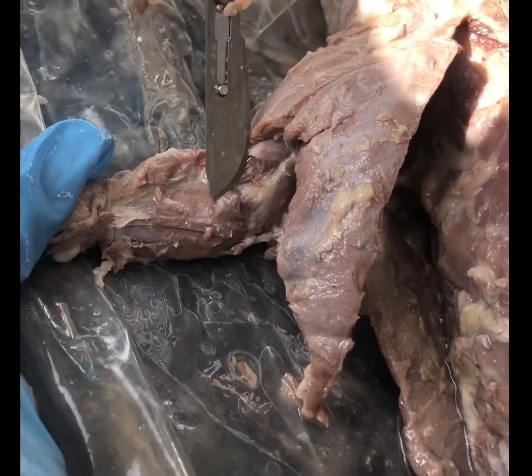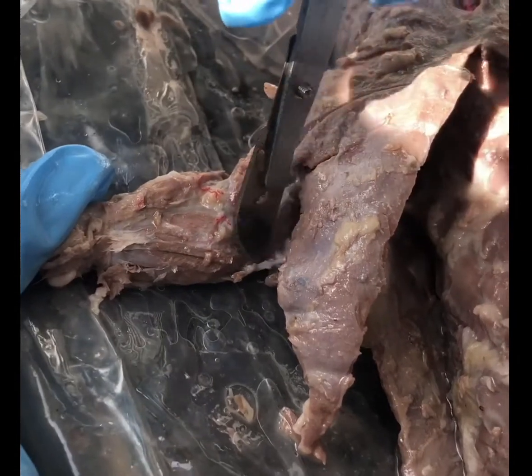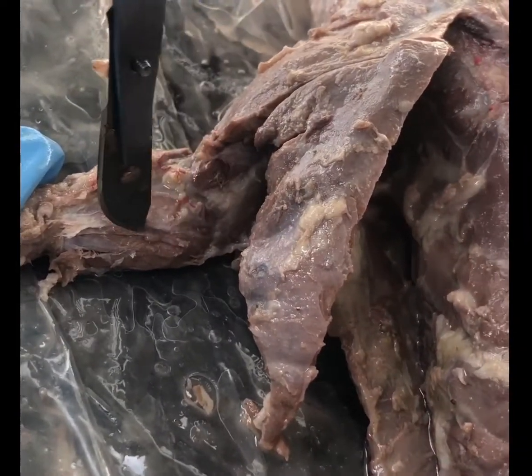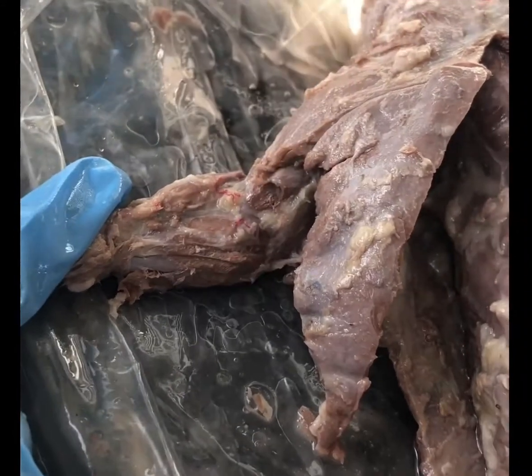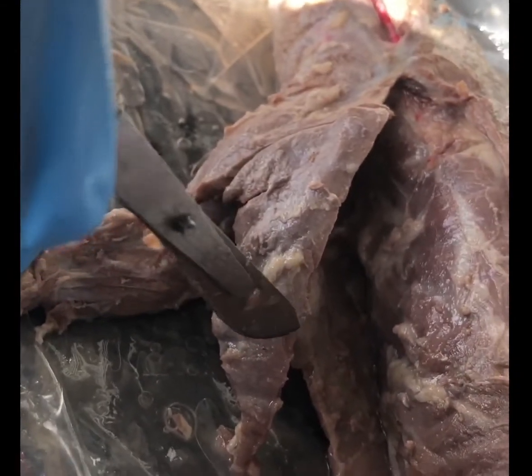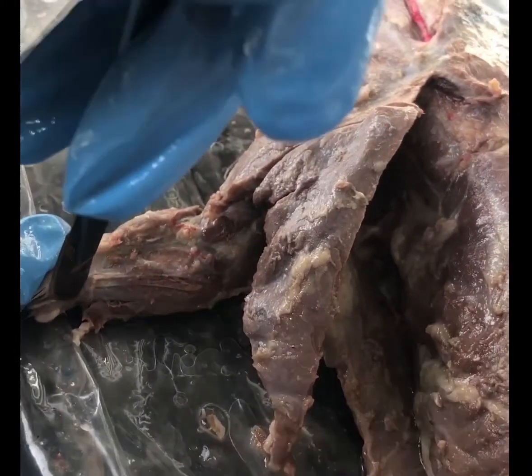Okay, now the muscles of the arms. The pronator teres pronates the forearm, so it goes from the elbow to the wrist, diagonally. So it's this muscle right here that goes diagonal. Can't really see it, but it's there. The flexor carpi radialis, which flexes the wrist, goes from the elbow straight down on top of the radius. So it goes from the elbow straight down to the wrist.